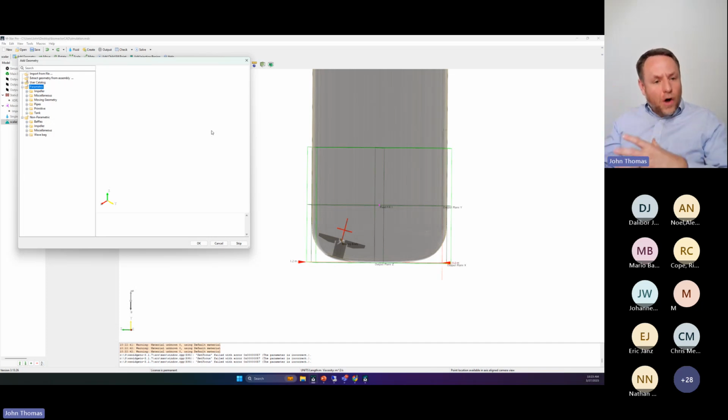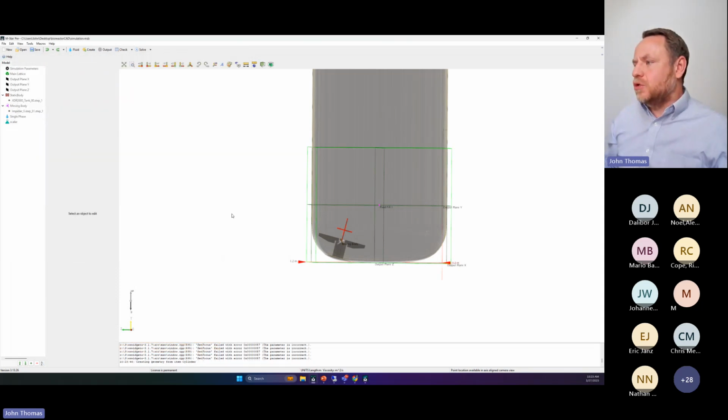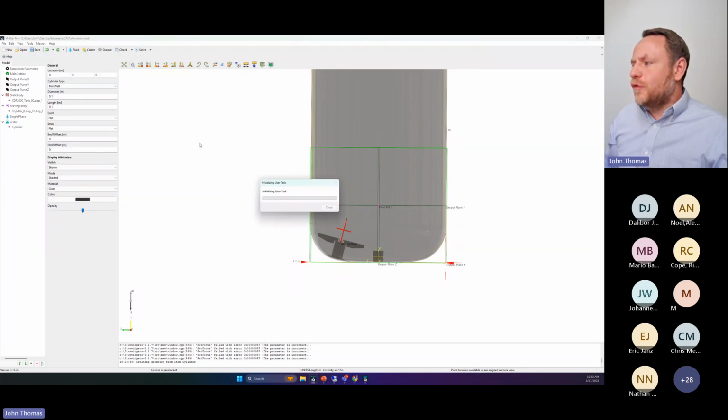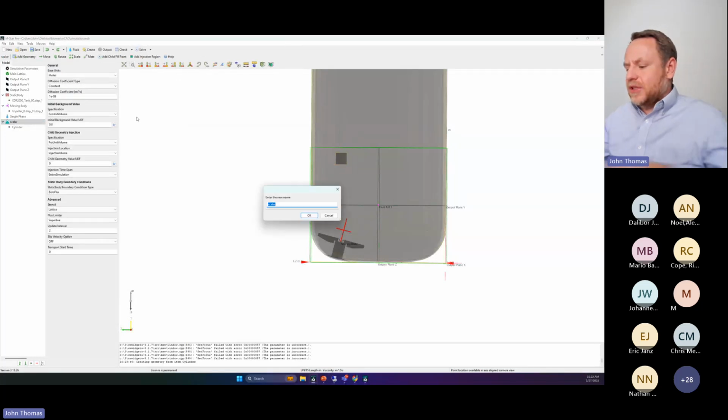The scalar evolves, as discussed earlier, via advection diffusion and the conservation of mass. So let me add some bolus here. I'll put in some cylinder of glucose, up near the top of the vessel. Let me go ahead and move this injection site up here and watch this guy start to spin, okay? And I'll just rename this glucose. It doesn't matter what it is.